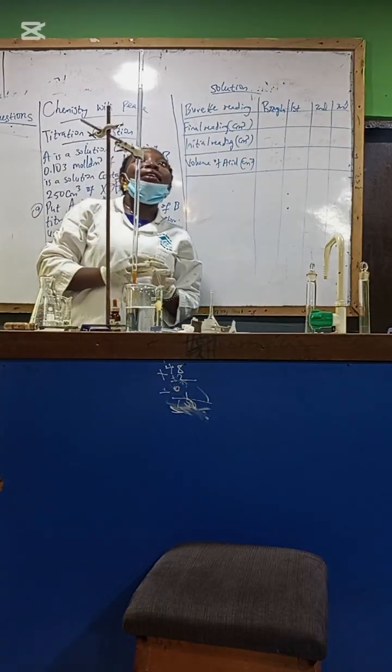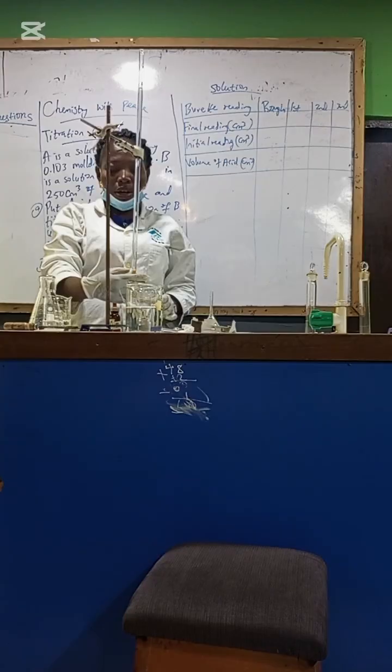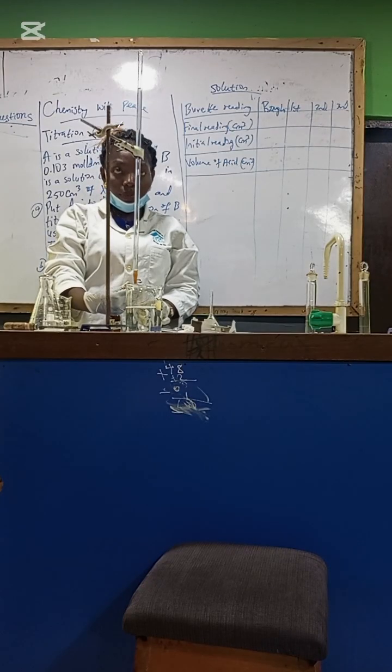And if you are reading, make sure that your eye level is at the meniscus.